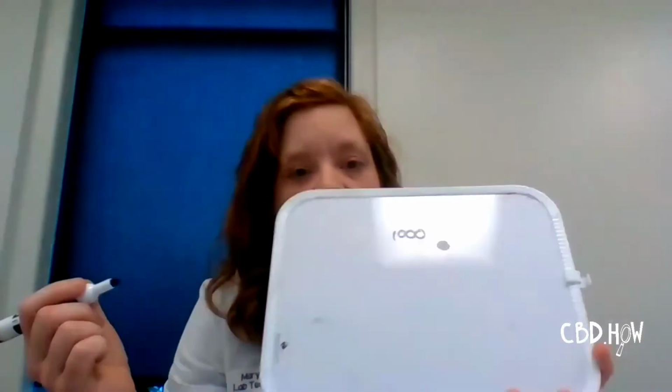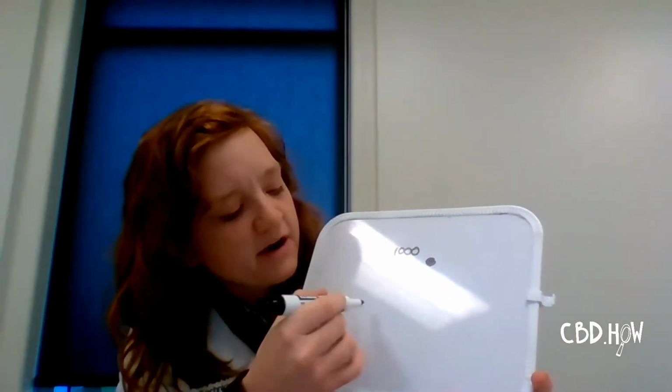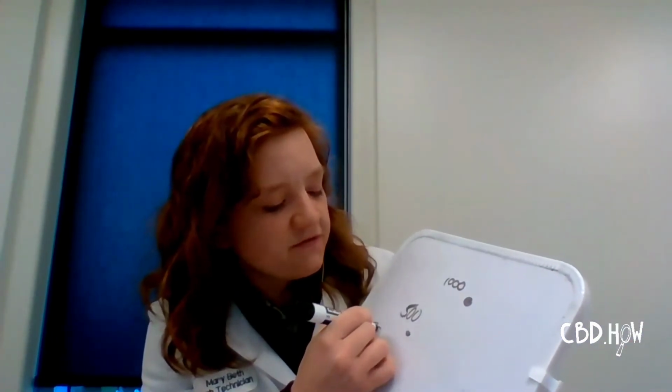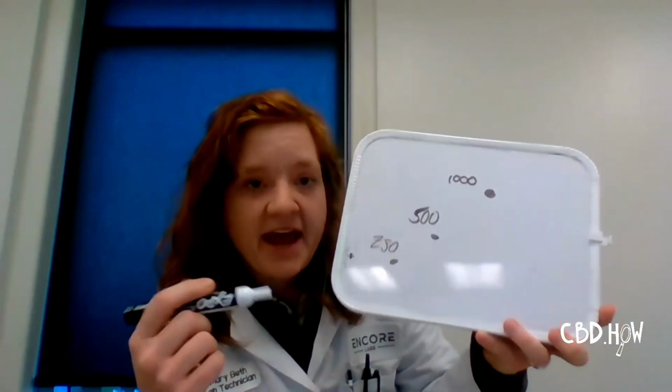So we tell the instrument this point is what 1,000 ppm looks like, and then we take that same standard and prepare it at half strength. So this is what 500 ppm looks like. And then we might prepare a quarter strength. So this is what 250 ppm looks like, and so on. And once the instrument has those points, it draws a line through them.